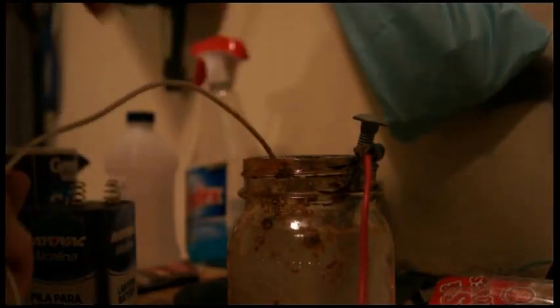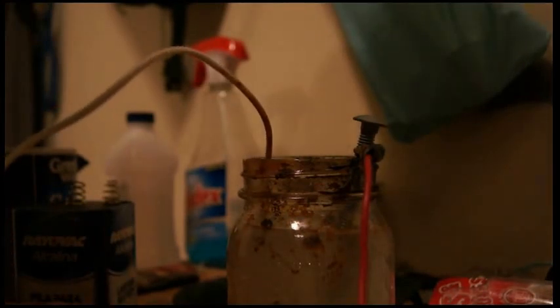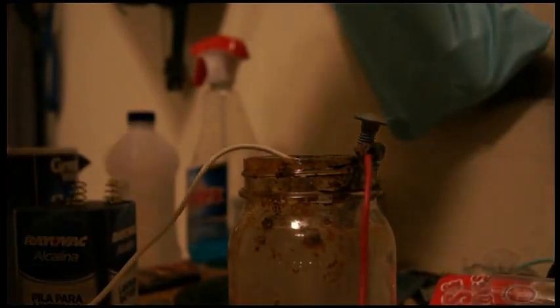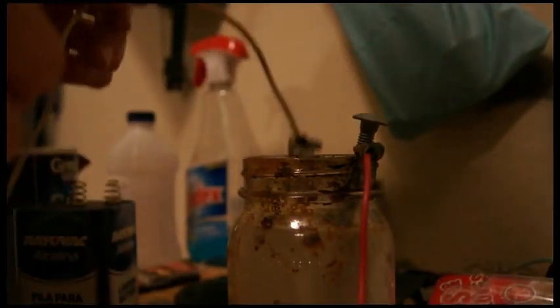Then grab your power supply and connect the alligator clip to the positive side. You're going to need a stripped wire with another piece of iron on the bottom. Put the iron piece in the water and connect it to the power supply. You'll start to see a bunch of bubbles, and you want to make sure that these things are not touching, otherwise this will not work.